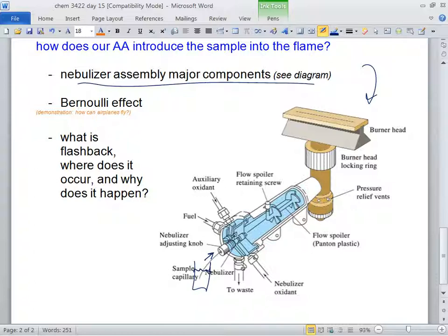What I was hoping someone would say is this: instead of dumping it in there like this or like this, make the droplets even smaller, right? That's what this little guy's doing. Get a little tiny dinky droplet.